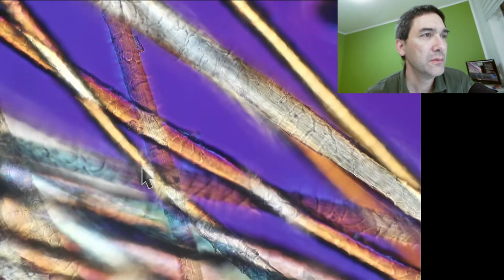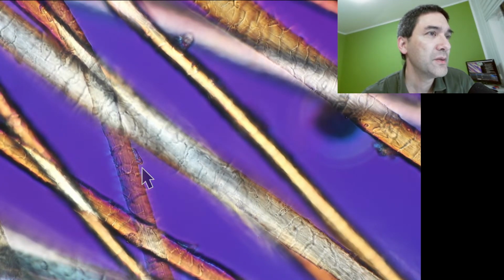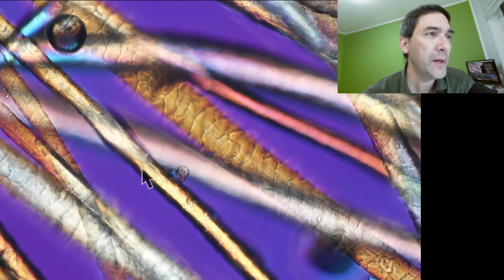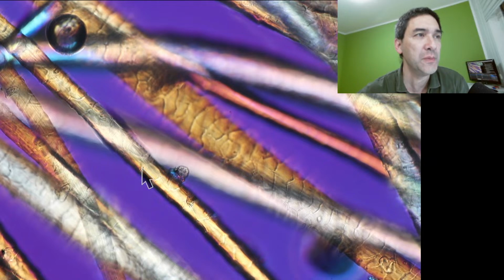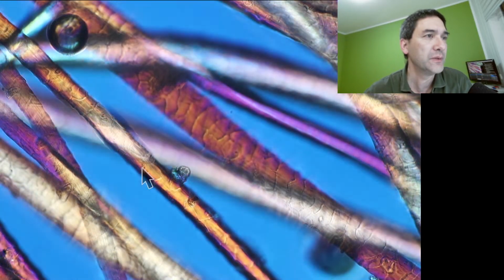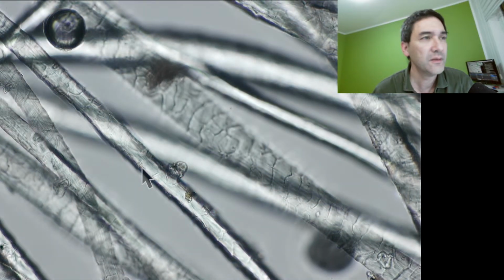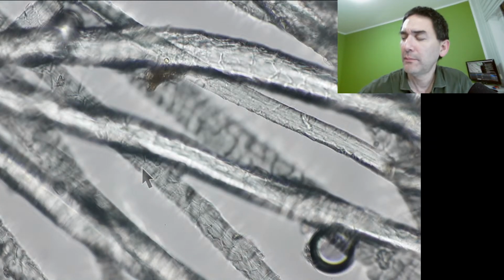Because hair, or the fur rather, right? Quite often I get questions, where do all of the colors come from? I just want to say that my microscope has a certain polarization setup, which allows me to change the colors around, like this. On the regular bright field, it would look like this. So that would be regular bright field.